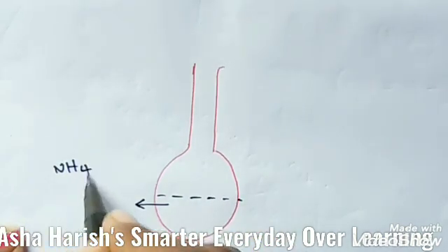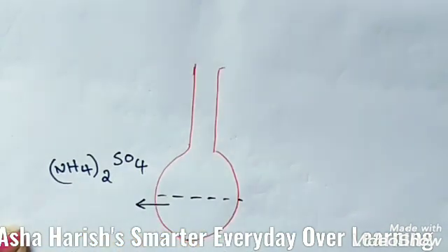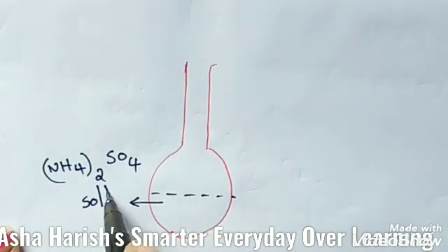NH4)2SO4. This is only ammonium sulfate, also called the digested solution, plus NaOH.